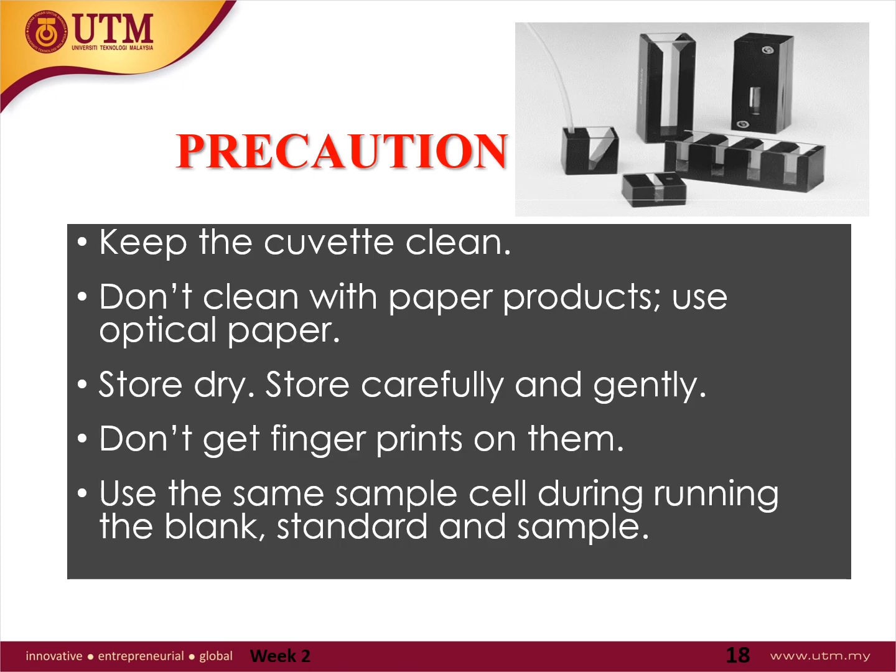Precaution. Since the cuvette gives one function in Beer's law, it means that you have to take care of the cleanliness of the path length, and you have to take care of the cuvette. The cuvette must be clean. Why? Because if you have fingerprints on it, your fingerprints can absorb the radiation, instead of the sample inside the cuvette. Your fingerprints outside the cuvette can absorb.